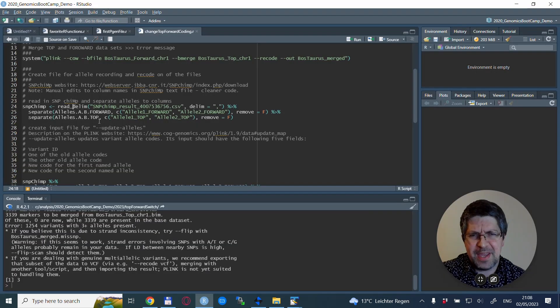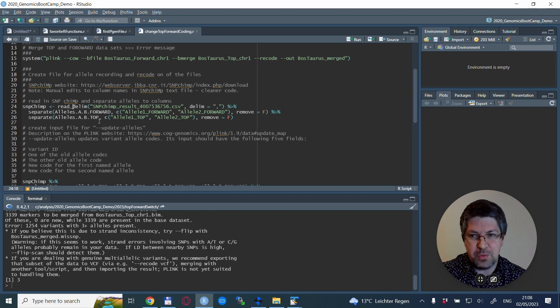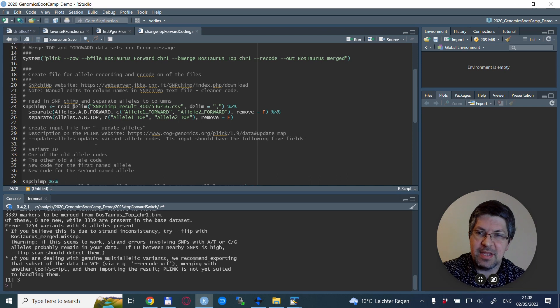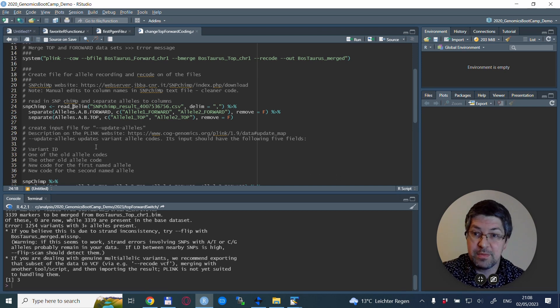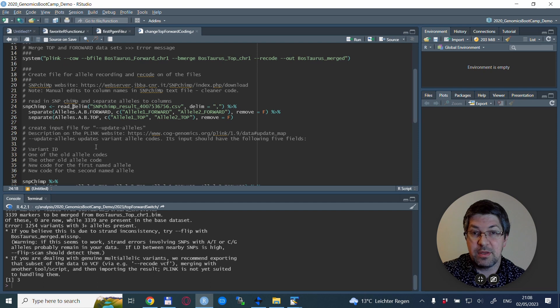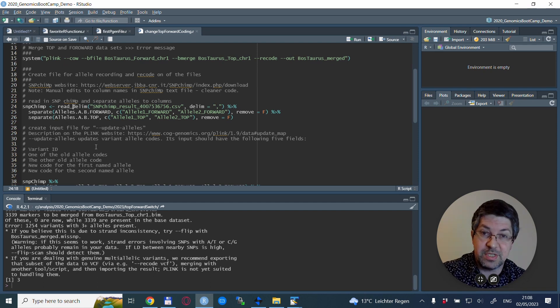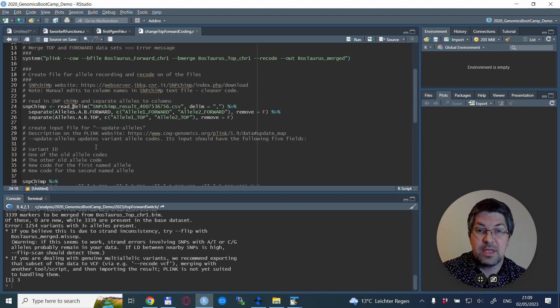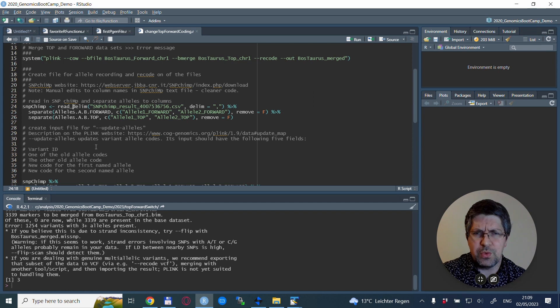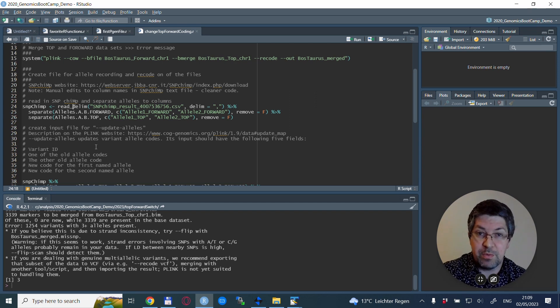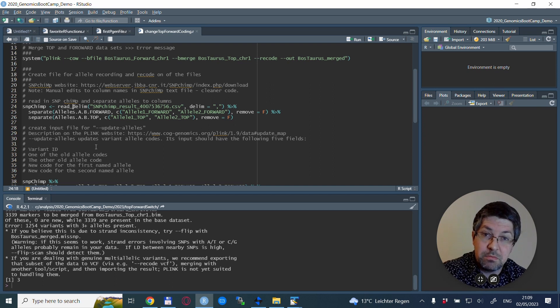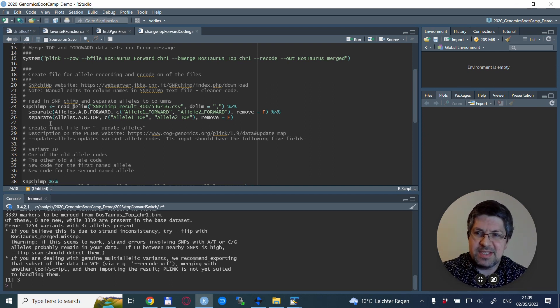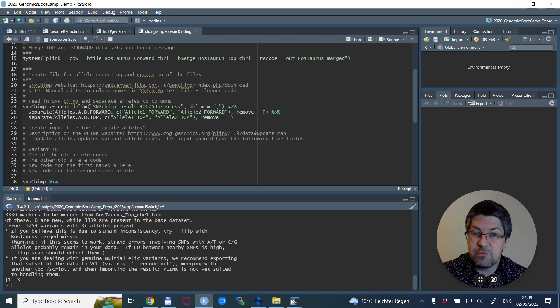We are back in R and ready for the follow-up. First thing we do is load this file from SnipChimp, then we separate the alleles for the forward coding into two separate columns and also the alleles for the TOP coding to two separate columns. We do all of this in one step with the separate function.